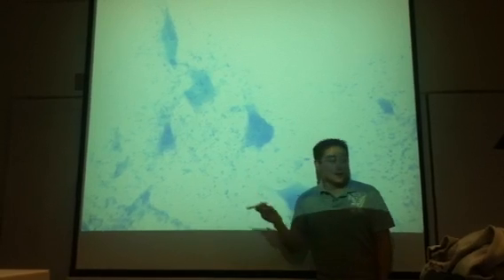One other thing — all these dots, do you guys know what those are? Glial cells. Specifically, the nucleus of the glial cells. That's about all the questions I can come up with. Can you please have a key in glial cells? Yes. I'm not going to guarantee that the other TAs might not come up with something else.